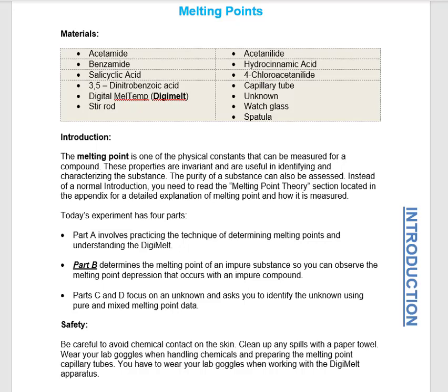Hello everyone. This video will act as the first experimental video for Organic 1 Lab CH4511. And so in this experiment, you'll be testing melting points.